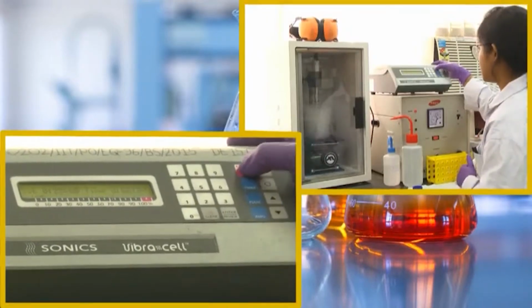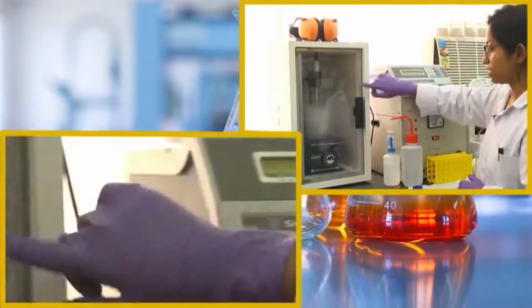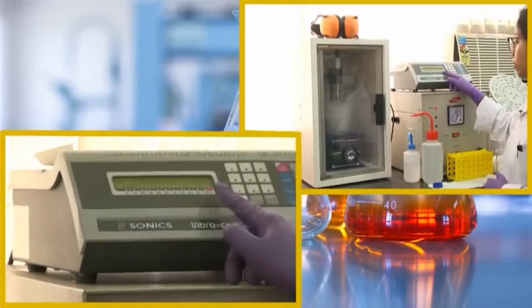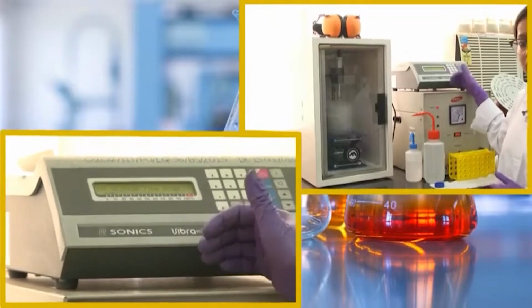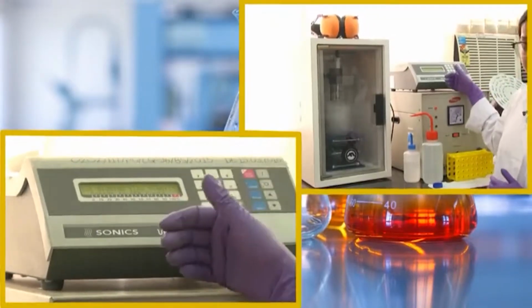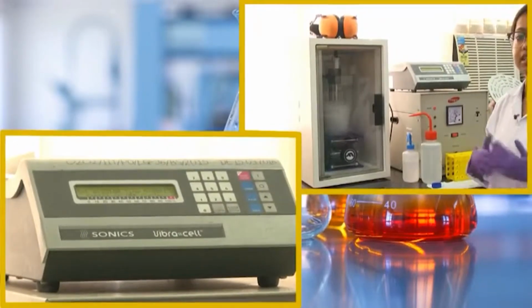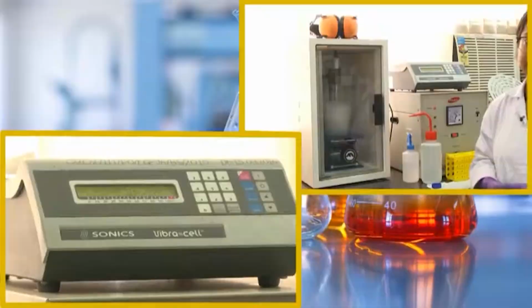And then, I am starting now. There will be a buzz noise coming out from this solution. Basically, it is generating the vibration right now. So, it is on, and I have put it for 25 minutes. It will be on for 15 seconds and then off for 15 seconds. Like this, the sonication will happen in a stepwise manner, and after 25 minutes it will be closed, and then we will go for the next step.